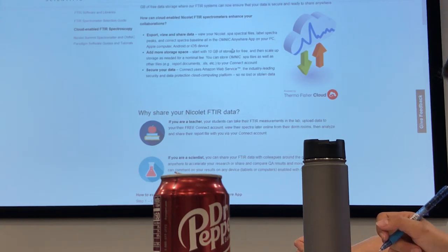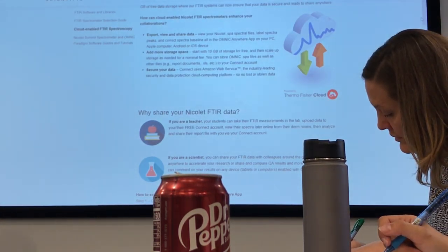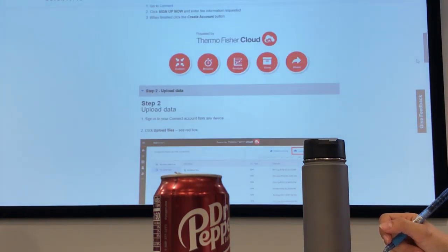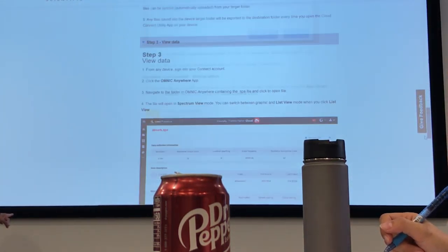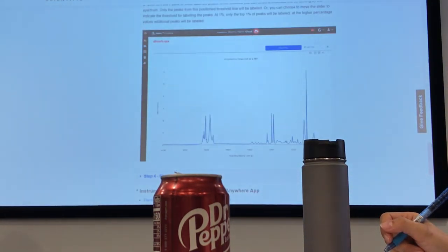Do you see one day maybe being able to bring in open source libraries and hook up? Right now this won't have it. It's the newer version. They haven't updated it yet. This one has only the first release details that we have up here, so you can see only the peak picks and other things, but you do have access.